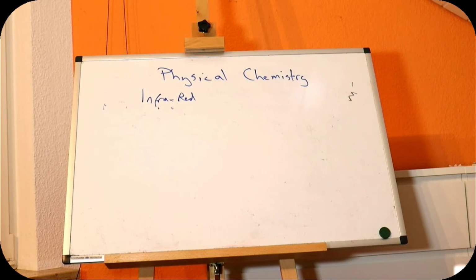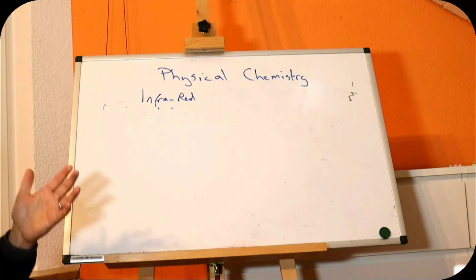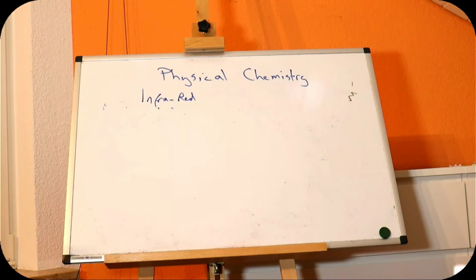Not that those things mean that Raman is completely useless, but it does mean that infrared still has a place in the useful analytical toolbox, because it is a tool that you can afford, that you can understand, that is easy to repair, and that is hard to measure crap with.